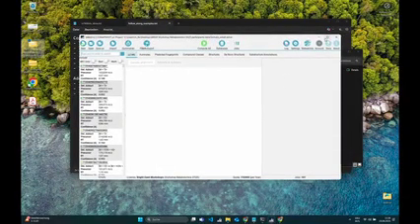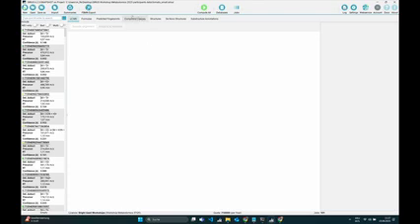And now we have our new project, and again, it's quite small, but in the top bar, you will now see that this is the new tomato_small project that we just loaded in. I hope everybody who wants is able to follow along. The first thing that you will see, if it was possible for you to load this in, is that now in this feature list on the left side, a new row has appeared, or at least new values, and this is this confidence score. Because now we have done all the computations included in this project space, we have now confidences. And this is also what Markus explained to you in the beginning. Maybe this is interesting to look at as a first glance. How confident are the annotations that you have?